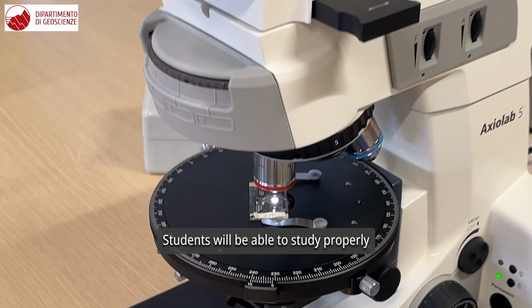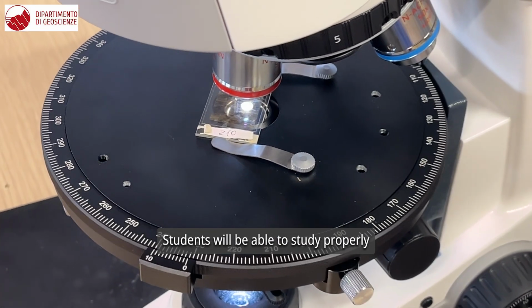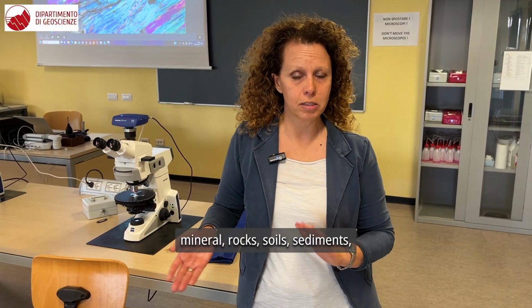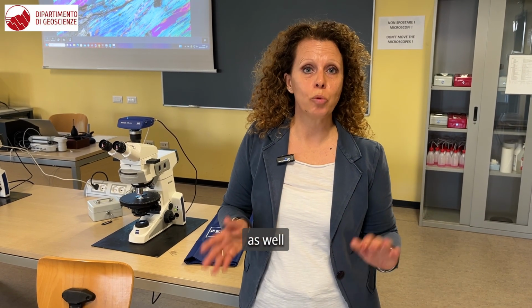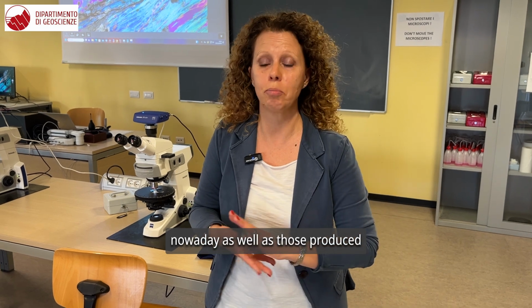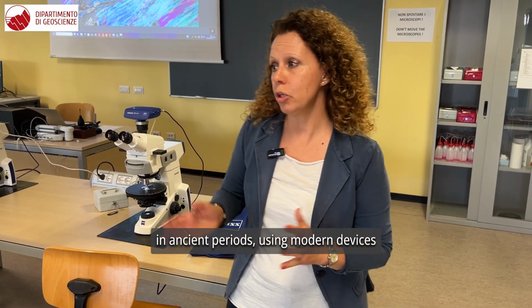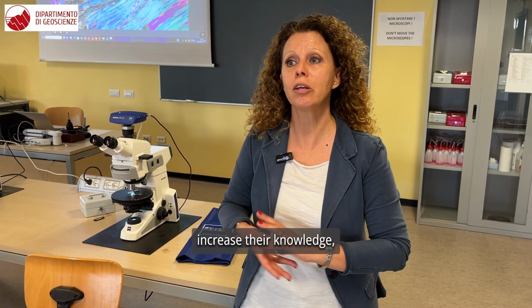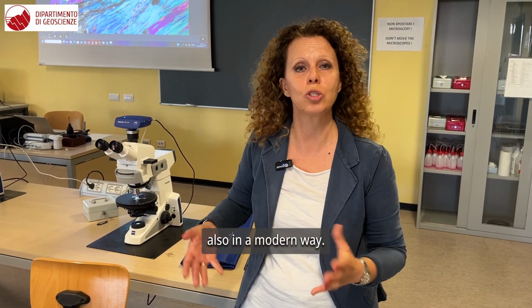Students will be able to properly study minerals, rocks, soils, sediments, natural materials as well as artificial materials produced nowadays, as well as those produced in ancient periods, using modern devices which obviously will increase their knowledge also in a modern way.